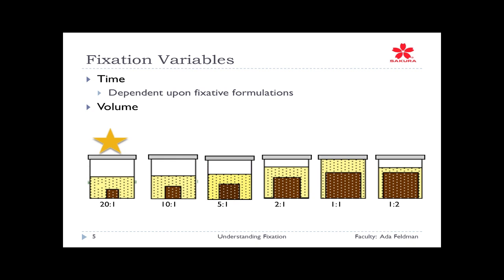It's being diluted with the fluid, and we're going to see examples of the actual artifacts that can appear, even though you may have it sitting in a specimen container for 30 minutes or more, or overnight. You can see it's not getting its optimal fixation.